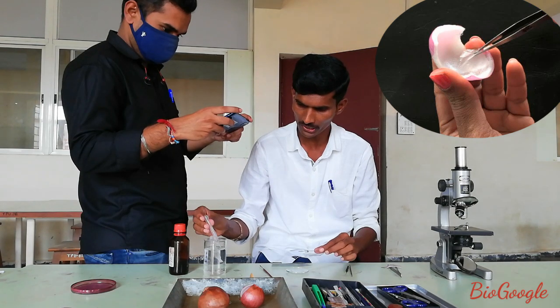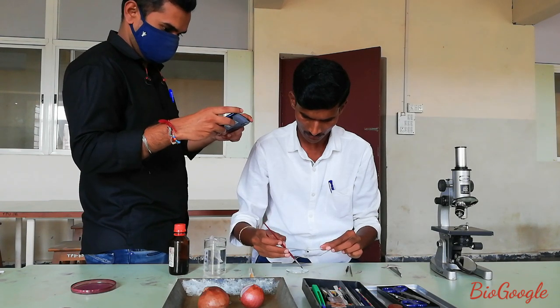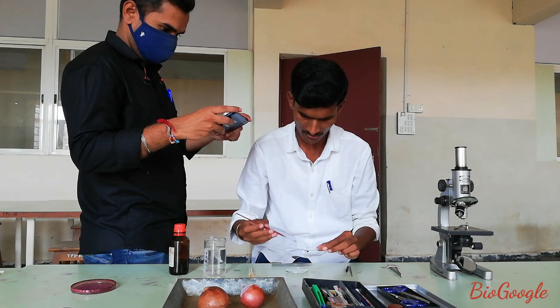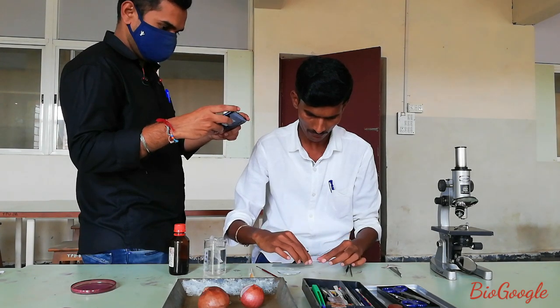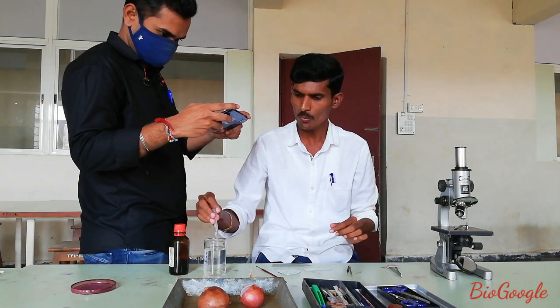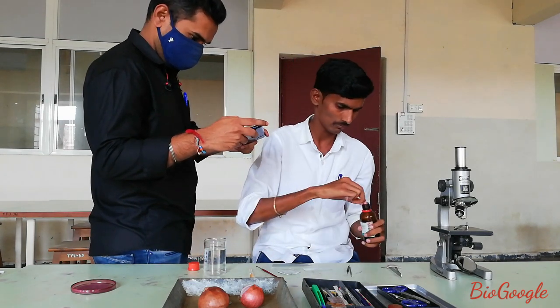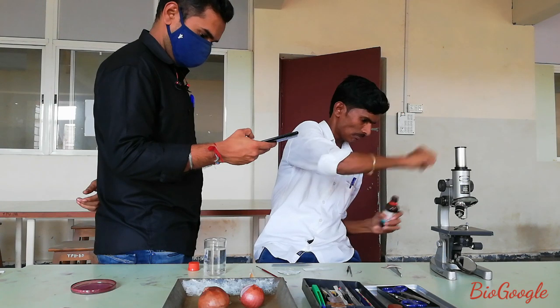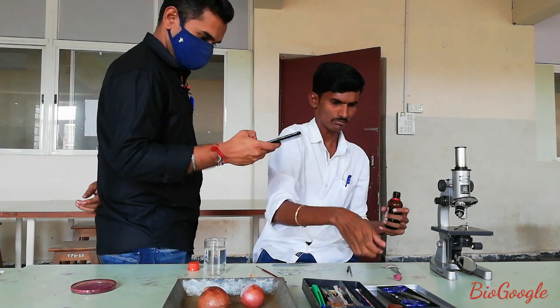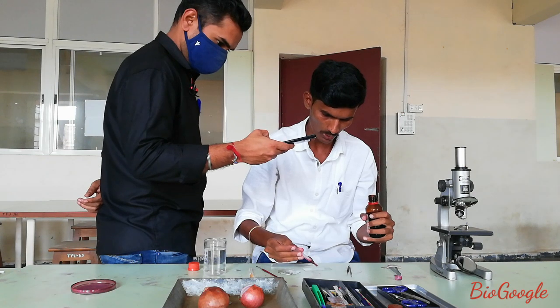First, put one drop of water on the slide. Transfer this small piece of peel onto the slide and add one drop of staining solution.